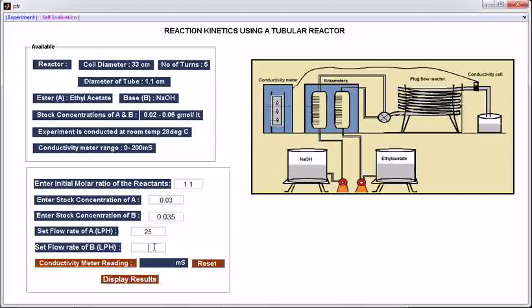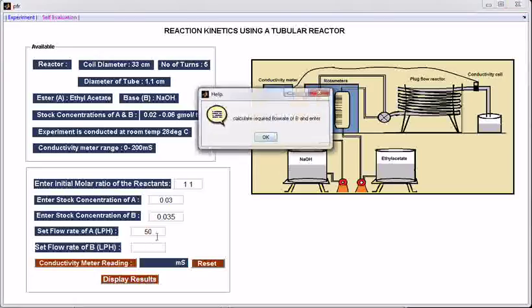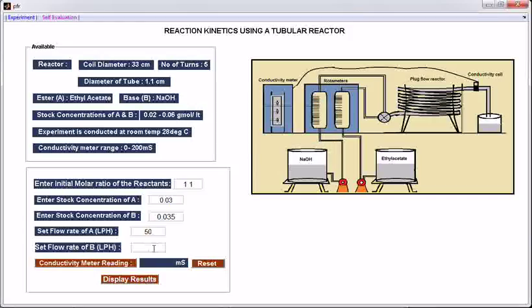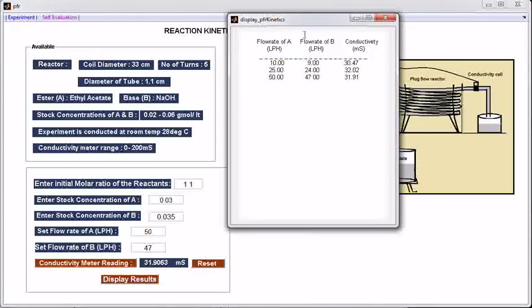Calculate and enter — the calculated value is 23.57, so rounded off to 24. Click, then reset. Repeat the same procedure for a few more readings. For 50 lph, VB is 47.14, so take the rounded-off value of 47. To see all these readings, click the button 'Display Results'. These are the flow rates we have entered, and these are the conductivity meter readings at these flow rates.